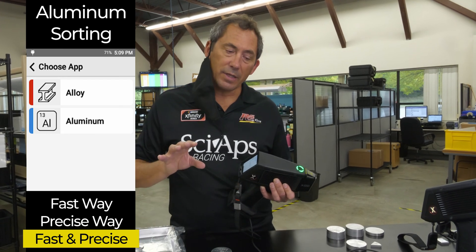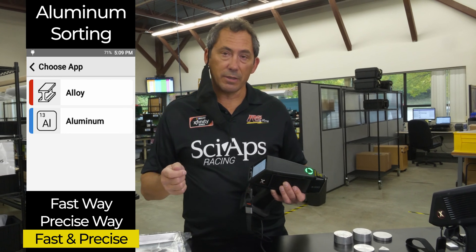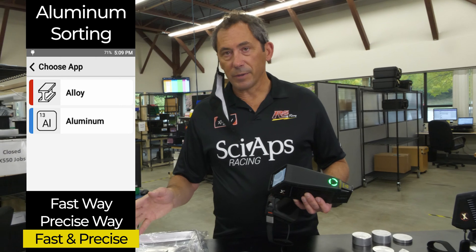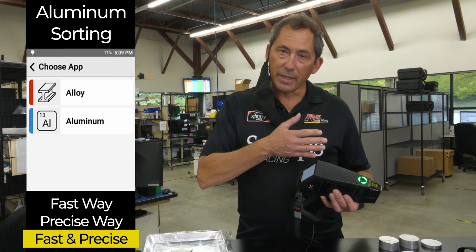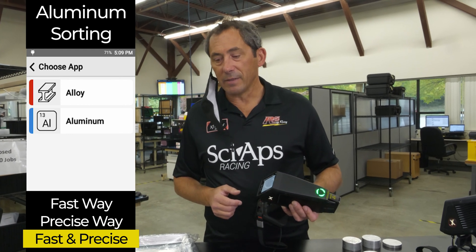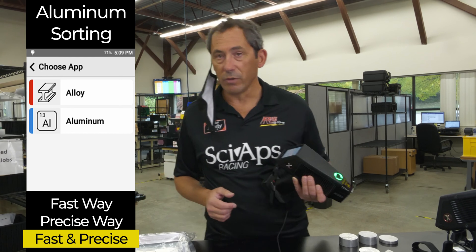So what it does, unlike other guns, it measures magnesium (Mg) and silicon (Si). It measures those and several other elements first instead of waiting for a second beam shot. By doing them first, you pick up a couple of seconds of speed. So with this you can really fly through your aluminum alloys.